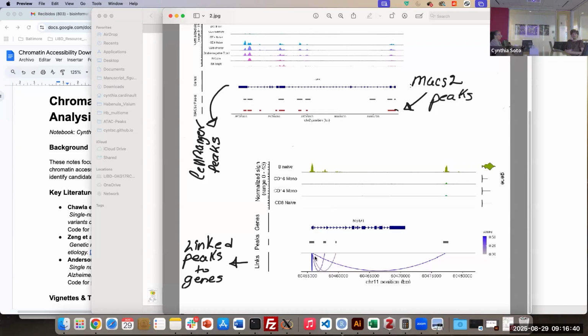So this is the big overview of how we can track all this information, but the challenge is how we produce this information, because you can produce it from the beginning. The thing is that the interpretability at the biological level could be really different depending on which steps we follow.